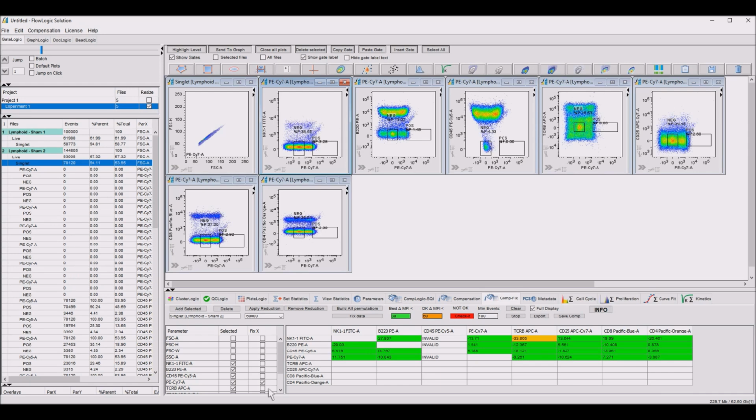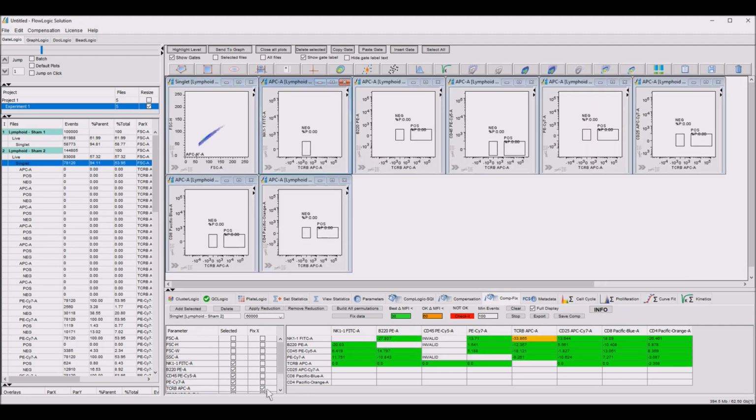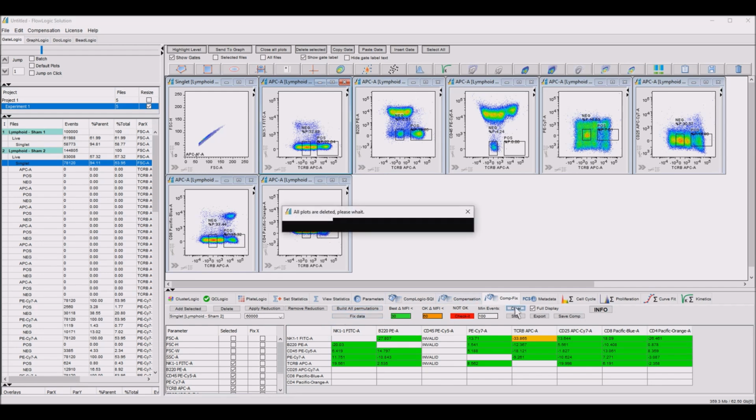The user can discretionally decide if that is okay or not. But the check is very quick. You can build all or you can go through one by one. It's your decision. We think that is okay, so we clean up everything.